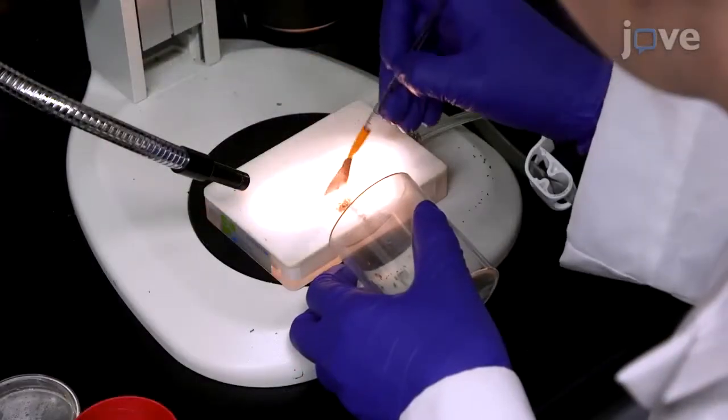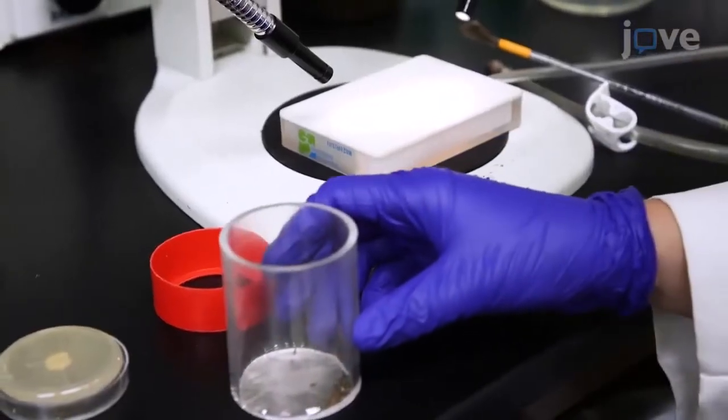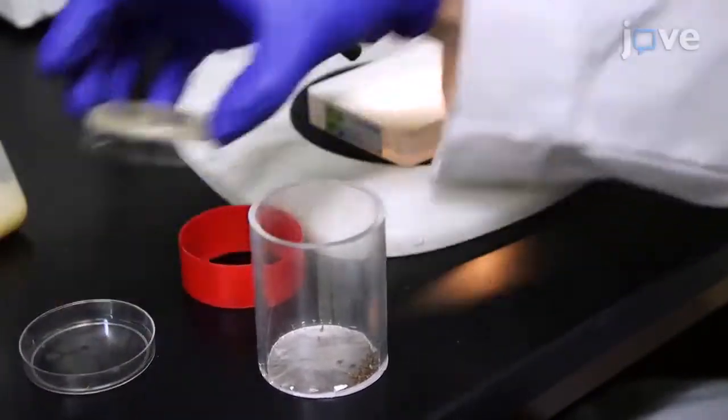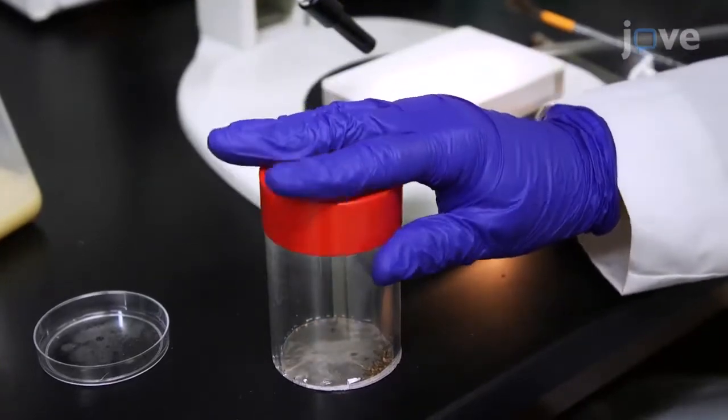The next morning, transfer the carbon dioxide anesthetized flies to a collection cage and place a pre-warmed apple juice agar plate with a small smear of yeast paste on the open end of the cage. Then secure the plate to the cage with the red sleeve.